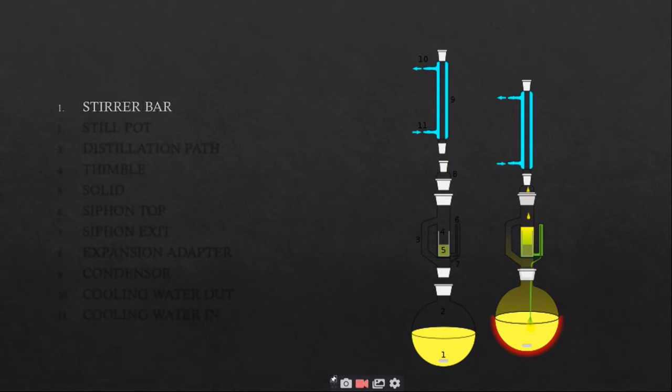Number one is stirrer bar in yellow color. Number two is still pot. Still pot should not be overfilled and volume of solvent should be three to four times the volume of Soxhlet chamber.